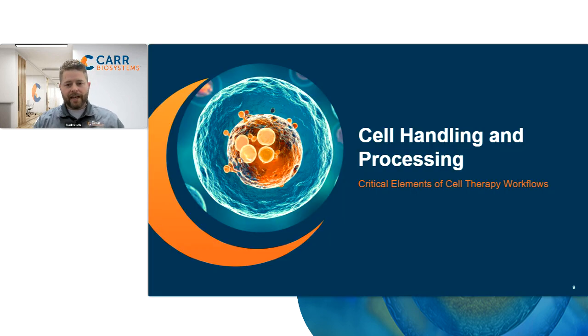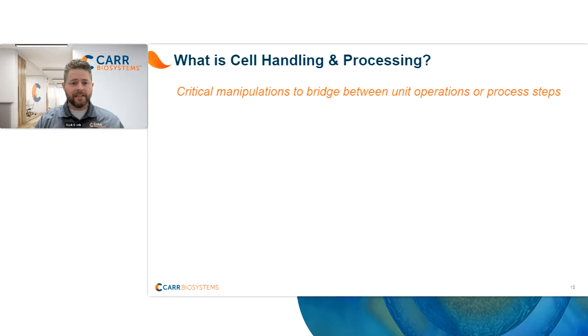So in terms of cell handling and processing, I'm going to use these terms a lot, and so I wanted to get down into what is cell handling and what is cell processing. Unlike a single unit operation, where the unit might expand the cells, that's a bioreactor, or might electroporate or transduce the cells, cell handling can be the critical manipulations that bridge the gap between unit operations or between process steps in your workflow.